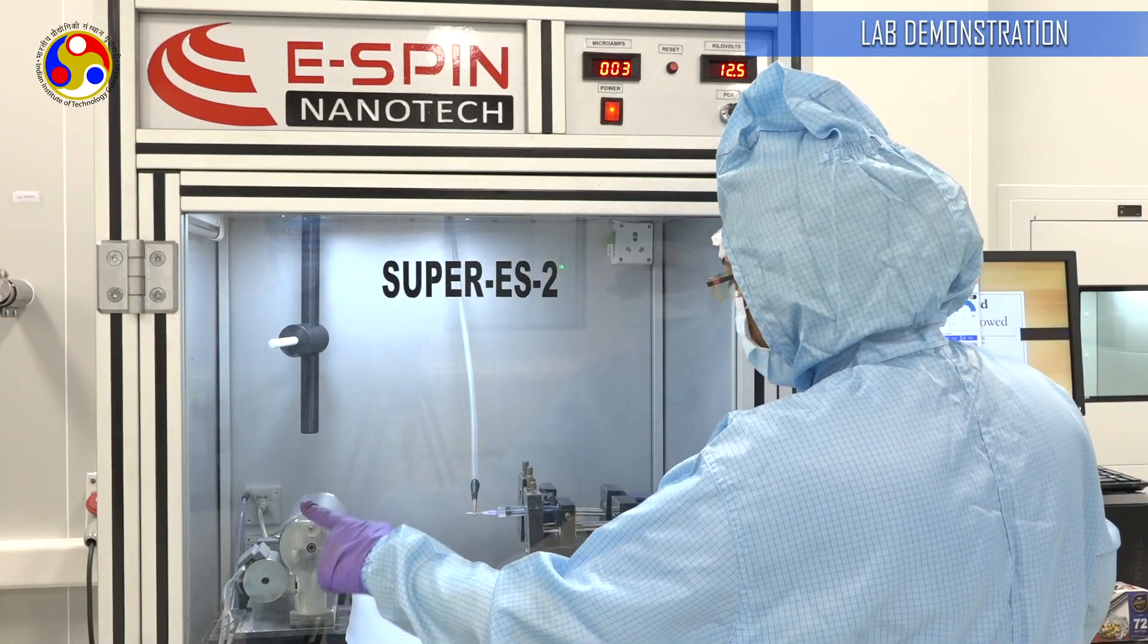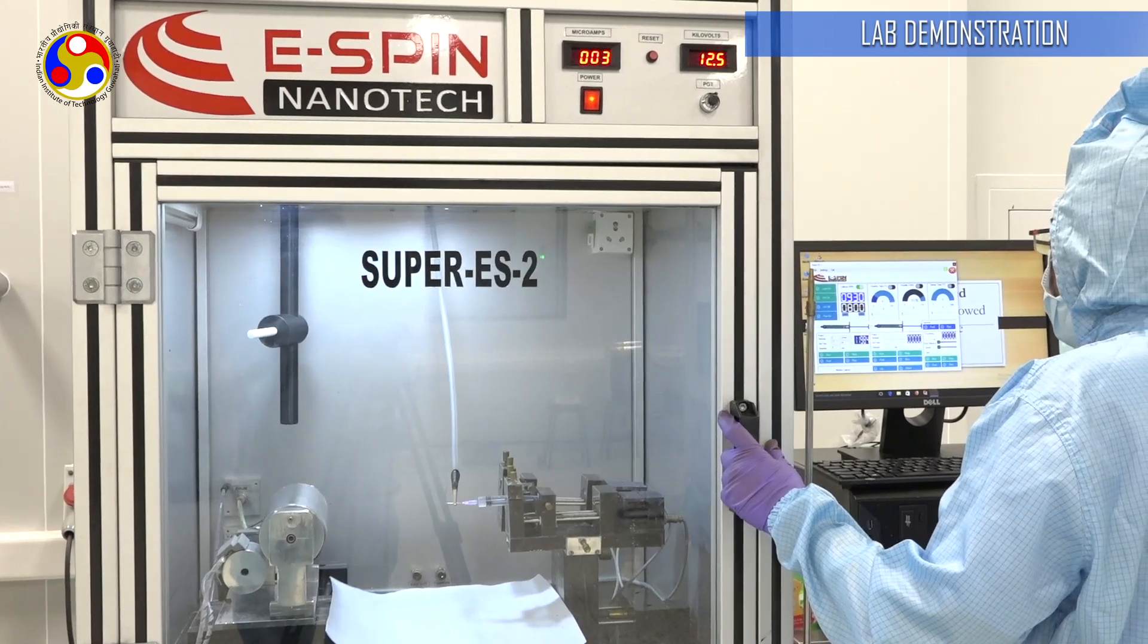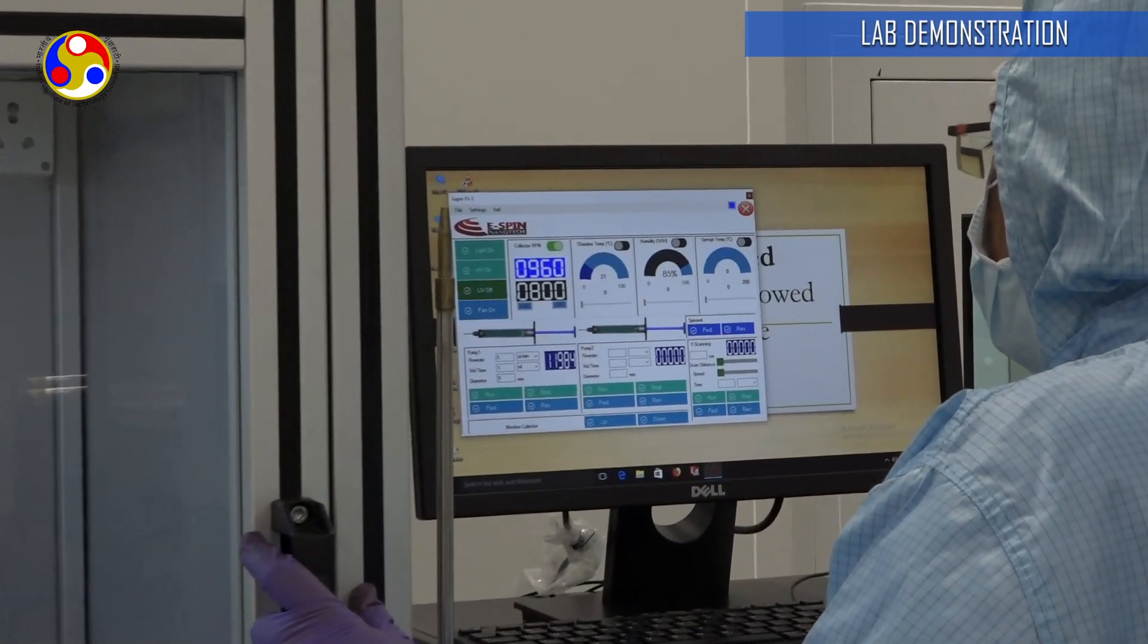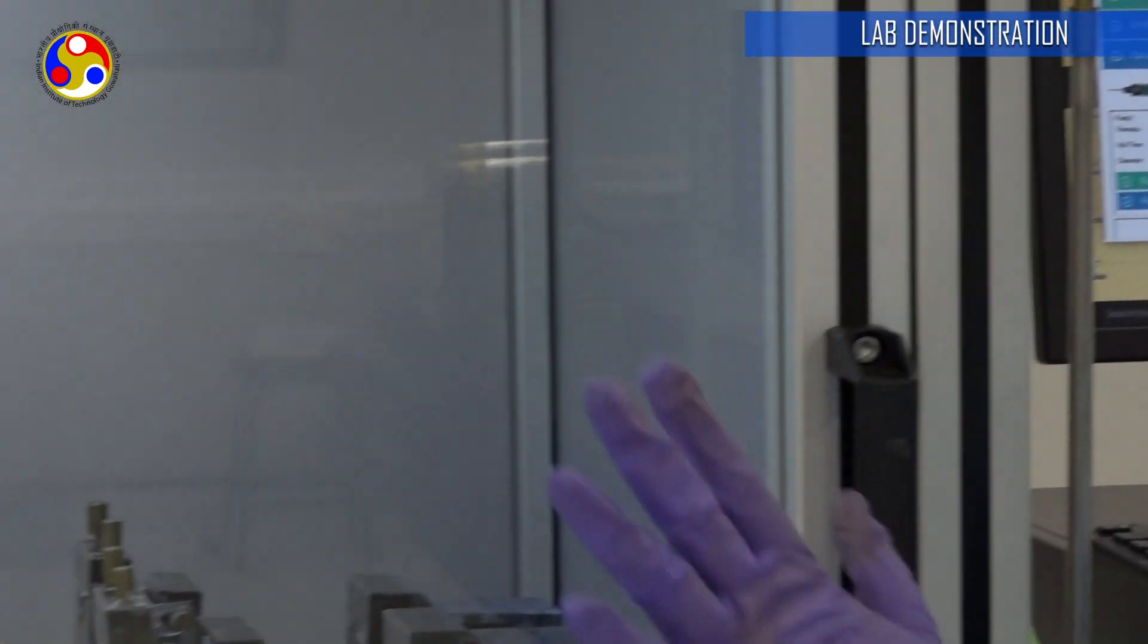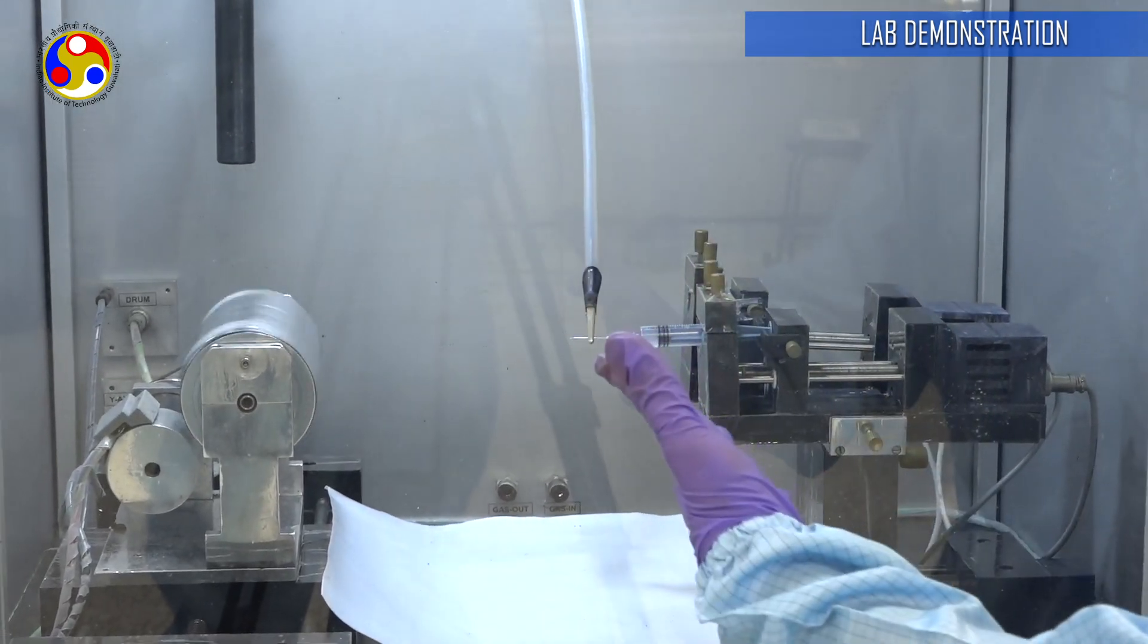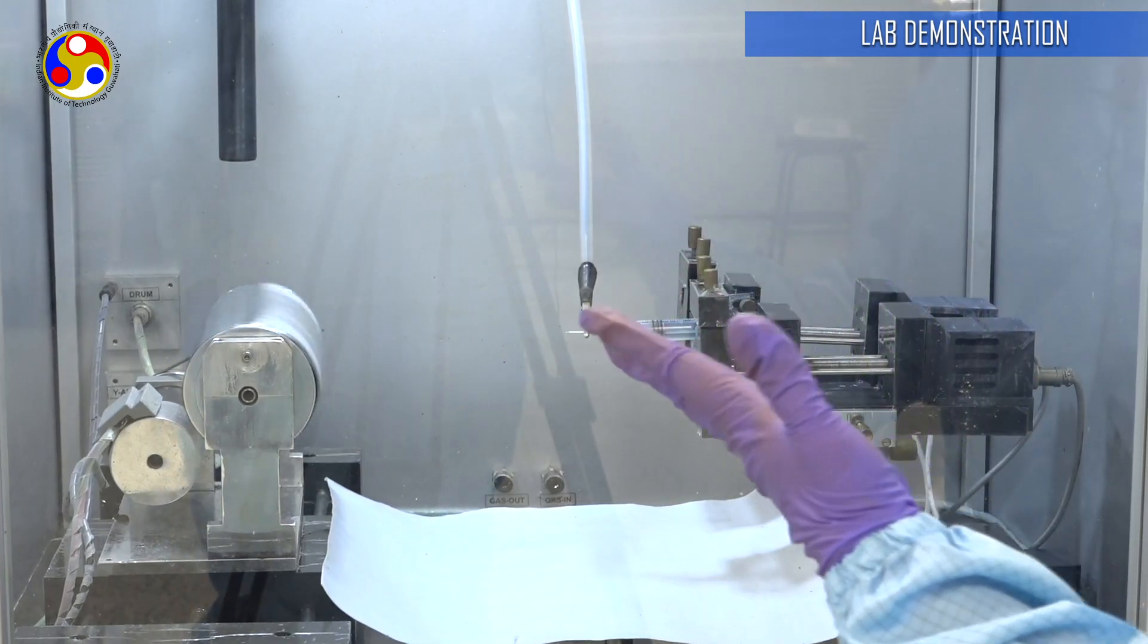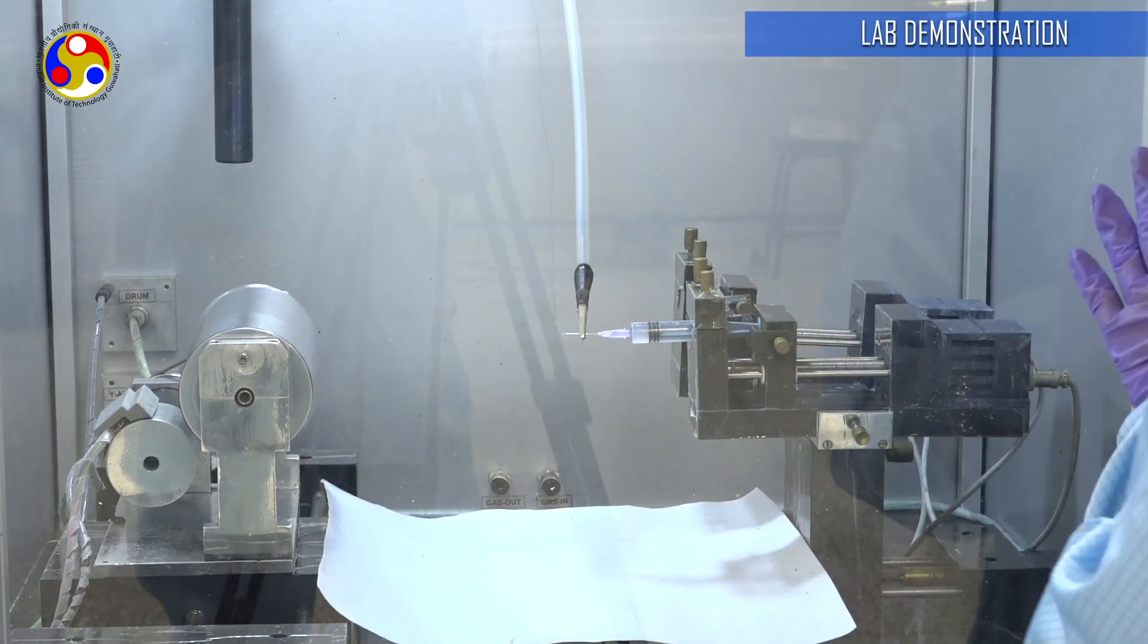My rotator is spinning, my sample is flowing. I have set all these flow rate parameters, volume, diameter, rotator speed, voltage and distance also. These are the most important parameters for electrospinning and if we follow this, it will give us polymer nanofibers within the diameter range of less than 1 micron.